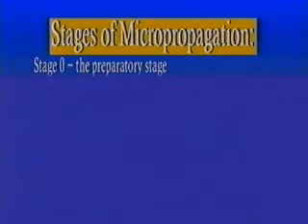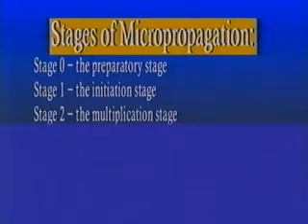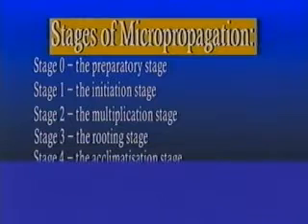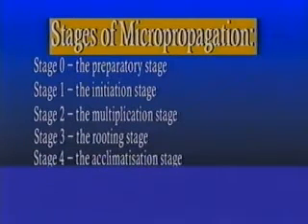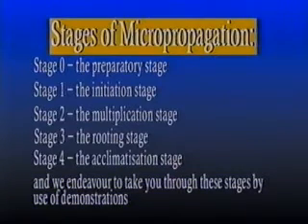Stage 0, the preparatory stage. Stage 1, the initiation stage. Stage 2, the multiplication stage. Stage 3, the rooting stage. And finally, stage 4, the acclimatization stage. And we endeavor to take you through these stages by use of demonstration.